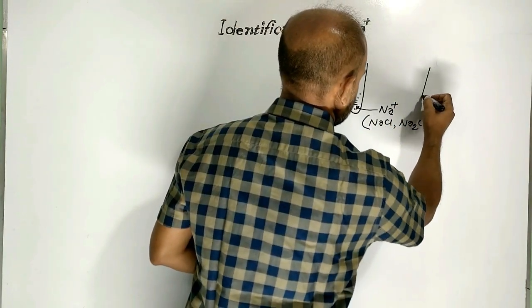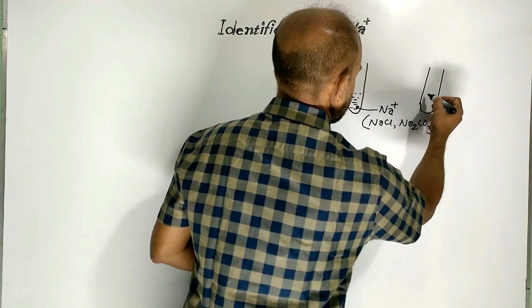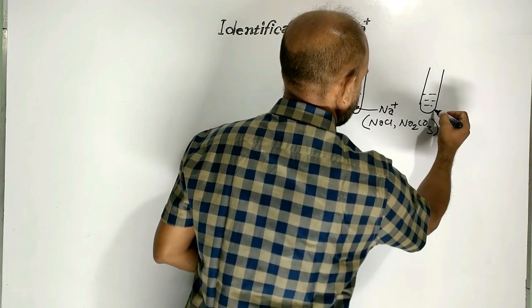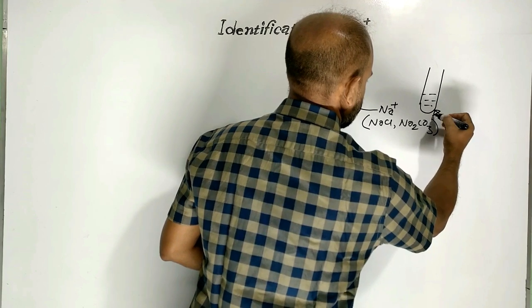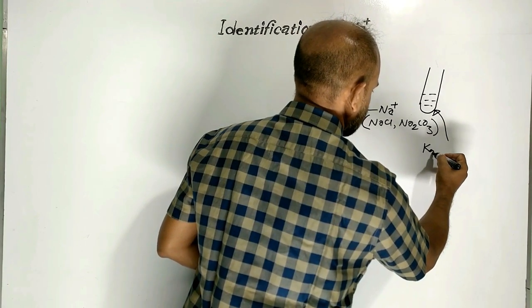Here, in another test tube, we need solution of potassium pyroantimonate.